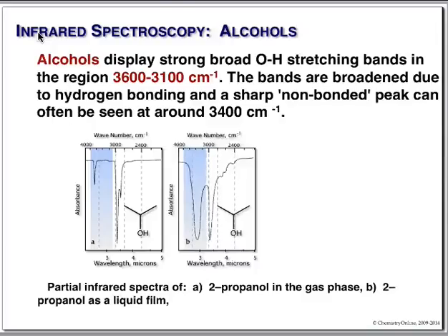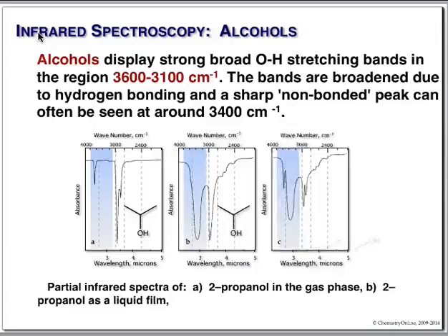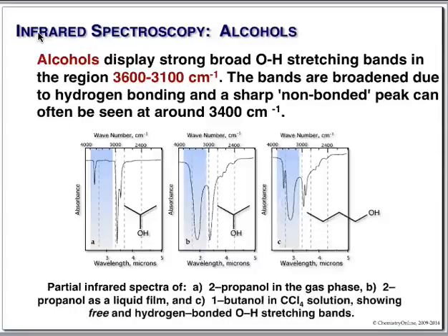You can play games with alcohol sometimes. If we take an alcohol and put it in a solvent like carbon tetrachloride, very nonpolar, and we make our concentration very low, you'll still get some hydrogen bonding, but you can actually sometimes see both the bonded and the non-bonded OH. So they're always there, but typically, this is what we're going to see when we look at an alcohol. Any questions?